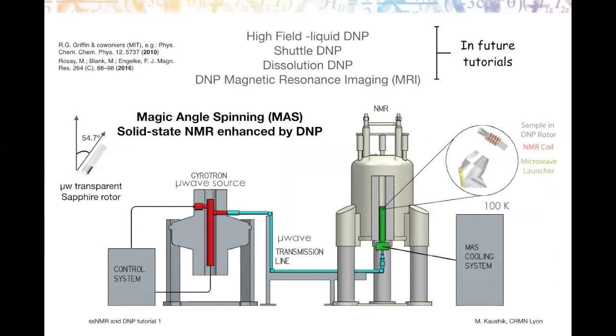So yeah, the basic difference between conventional NMR and DNP enhanced NMR is that in addition to the NMR magnet, there is also the gyrotron, which is a microwave source. Microwaves are fed to the magnet through microwave transmission line. And these experiments are performed at cryogenic temperatures. Remember the spin polarization versus temperature. At lower temperature, there is higher spin polarization. So we go for cryogenic temperatures.